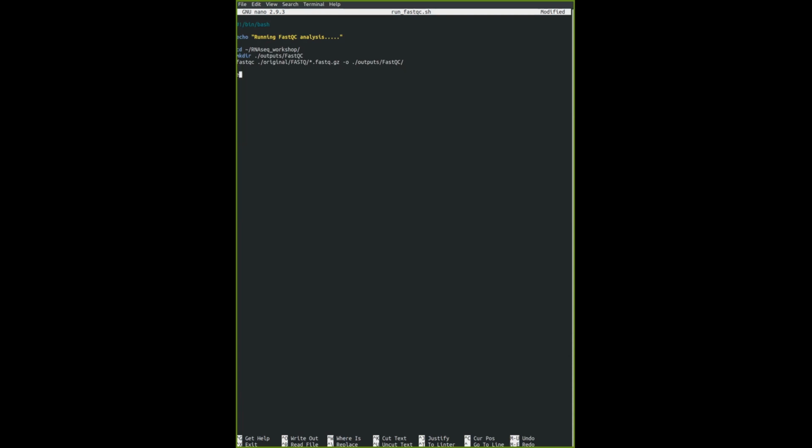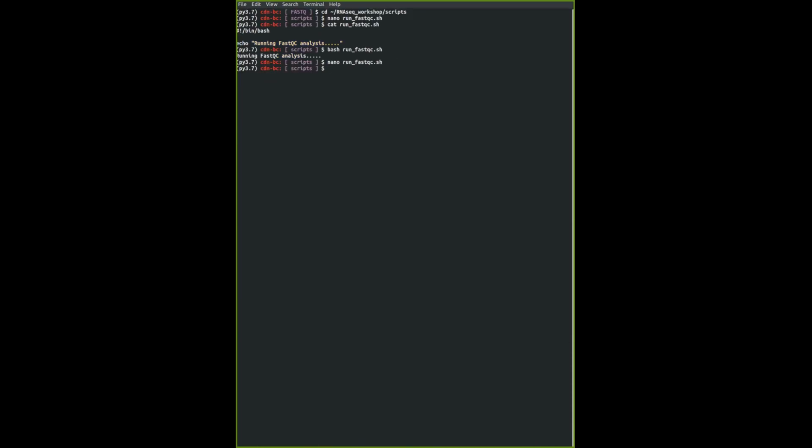And I'm gonna put the cherry on top by echoing completed, just to have this dopamine surge once you see that your script finished. It's nice to have this feeling that it's done. All right, and that's it. Control O to save, and then Control X to return.